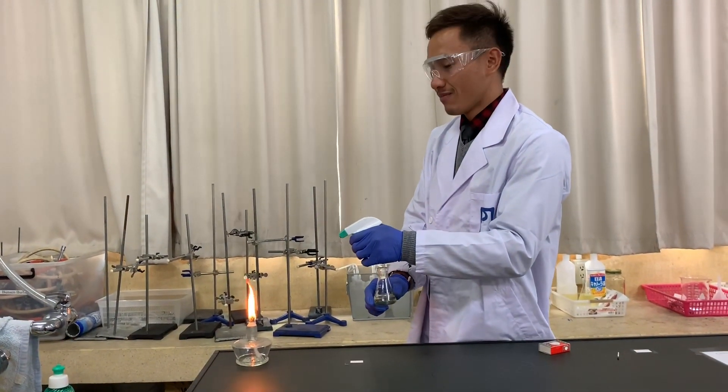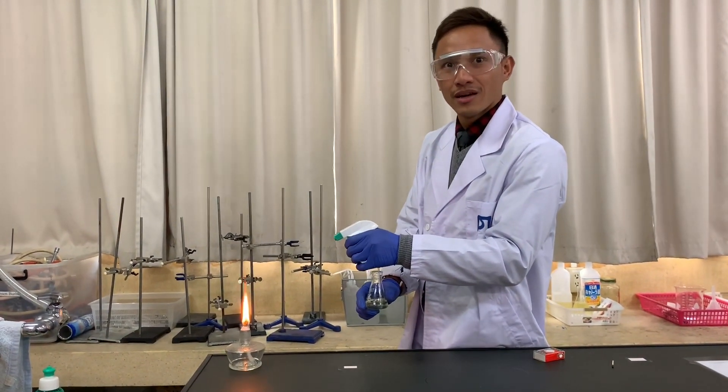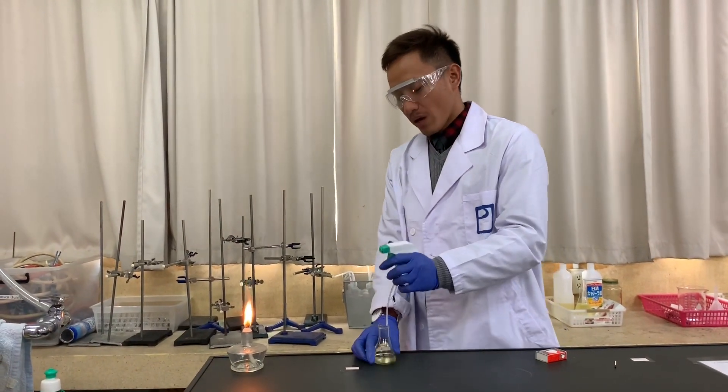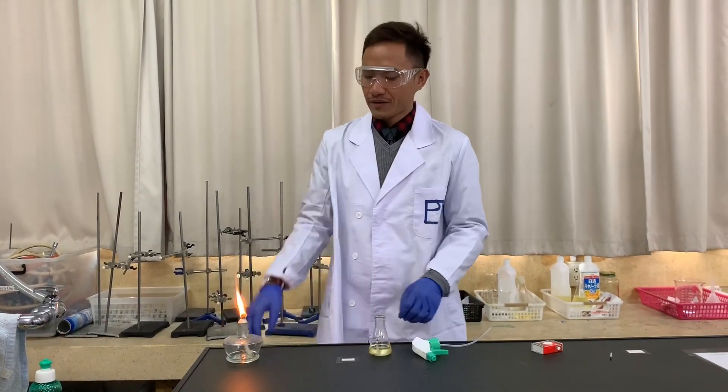You should be getting that kind of flame. Do you see that? That's the flame — spray it to vaporize the biodiesel and you'll get that result.